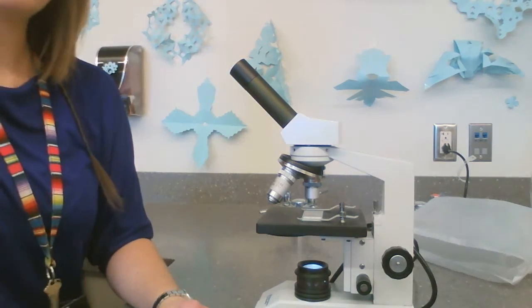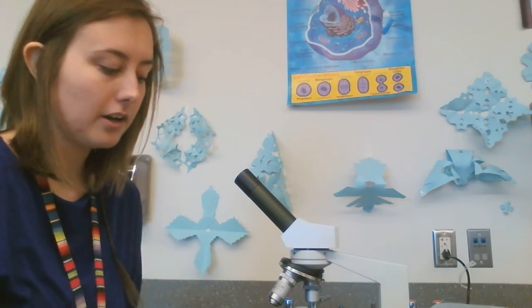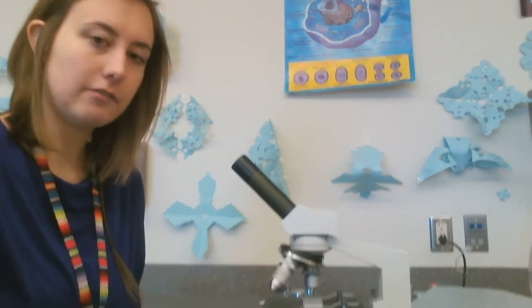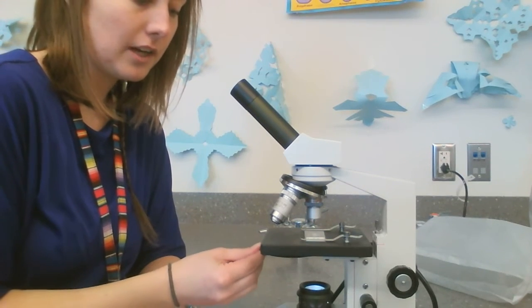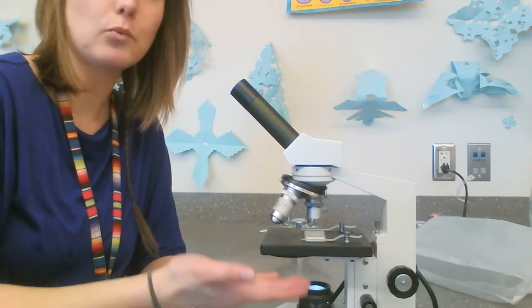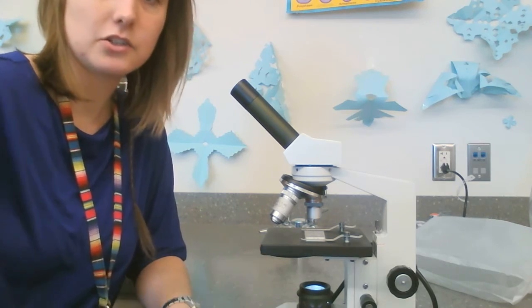Now, if you can't see your specimen very well, like if it's too dark, you might need to adjust the diaphragm. That's this dial on the front. If it's a higher number, like 4 or 5, that means it's letting more light in from the light source, okay? So you might need to adjust that if it's too dark.